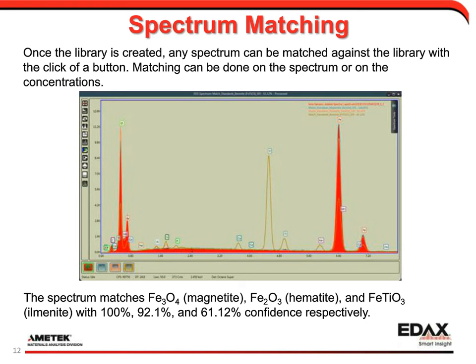I don't need to go in through my quant. I don't need to remember that magnetite has this composition, and I don't need to do the math on my quant numbers. 57 and 43 corresponds to 4:3 ratio, and realize all these intricacies of the analysis. So I cut down the time significantly, and I get a confidence level of the match to the compound.